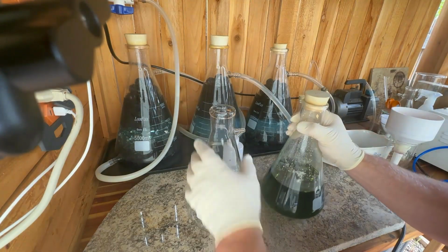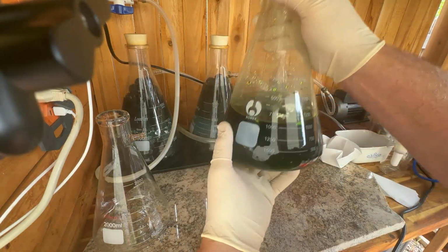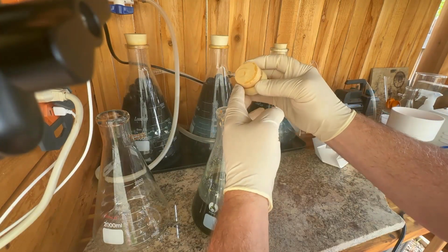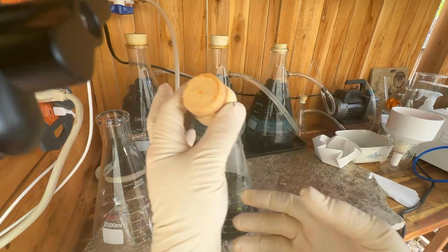Okay, well, to start, we're going to filter the solution. You can see here it's got a bunch of solids, not just floating on it, there's a bunch at the bottom. Most of this has come from stoppers. This is the second stopper that this particular beaker has destroyed. You see it's cracked, it's coming apart. It's trash.